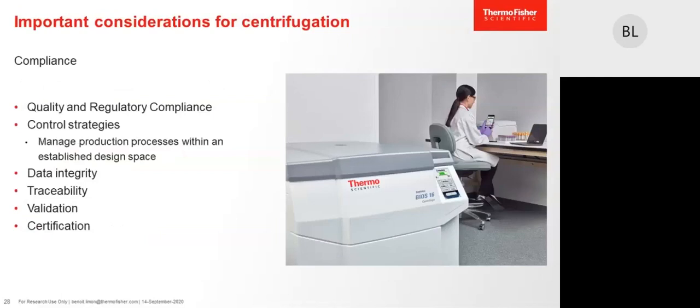The compliance, of course, is to ensure the quality and the regulatory and control the strategy for the data integrity, the traceability, the validation, and the certification.